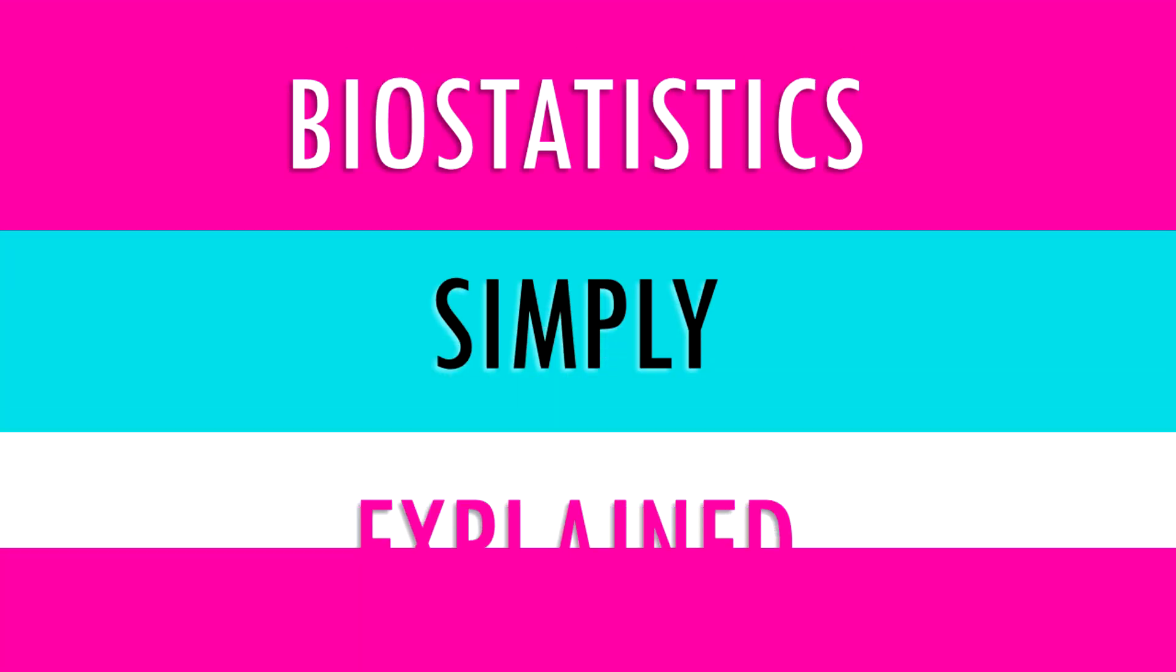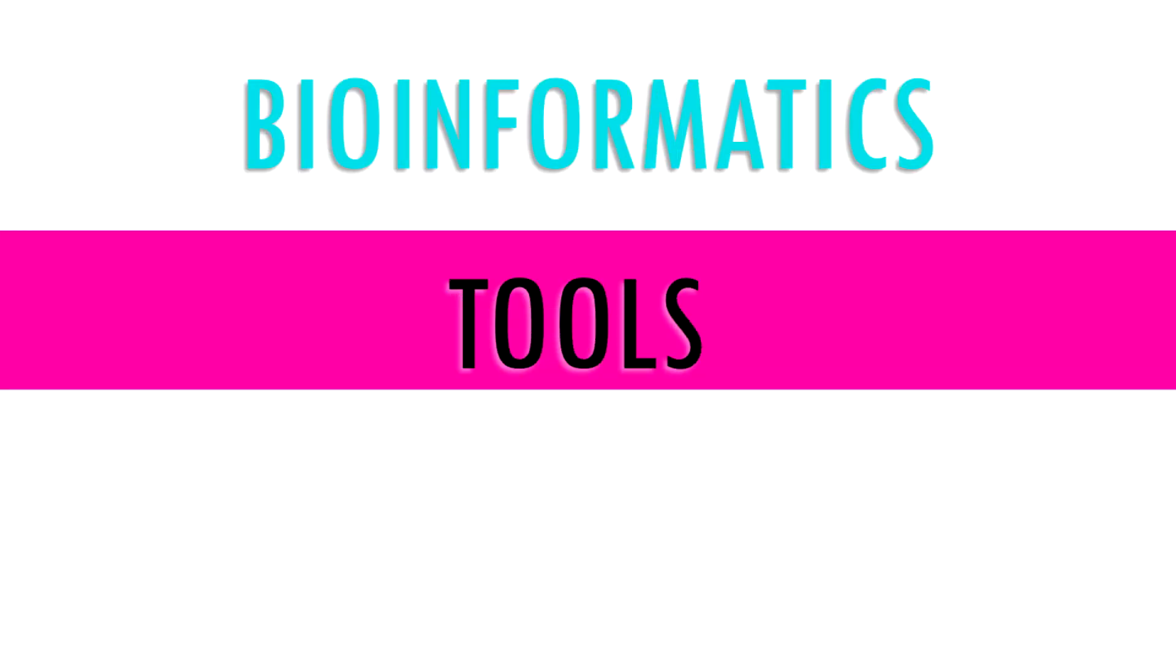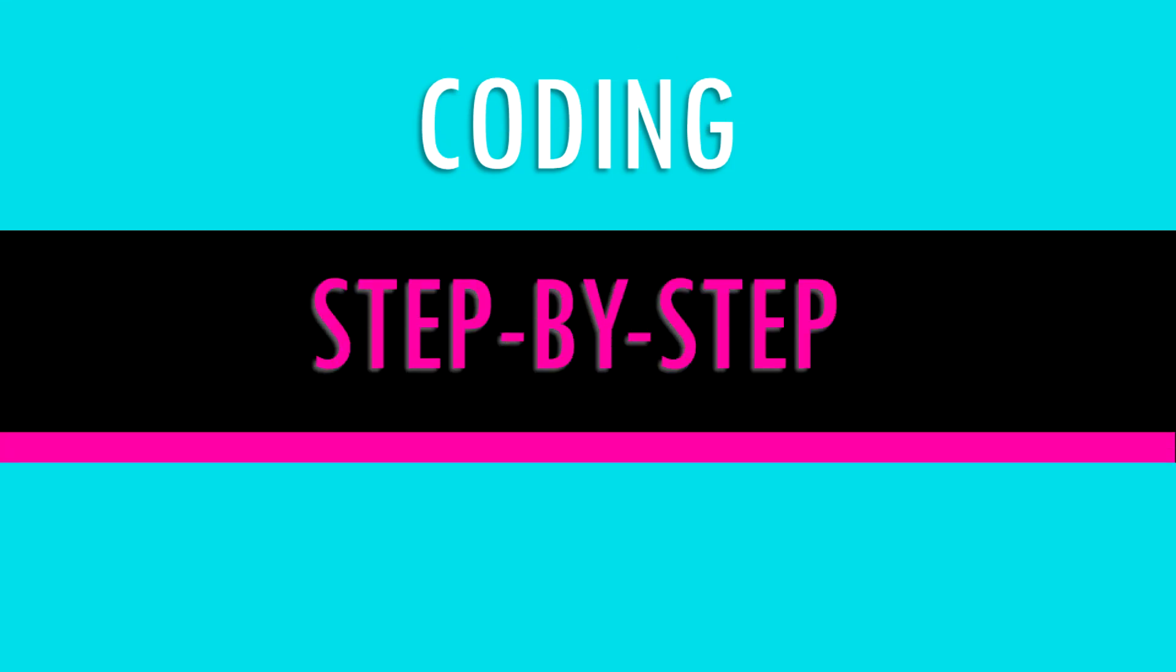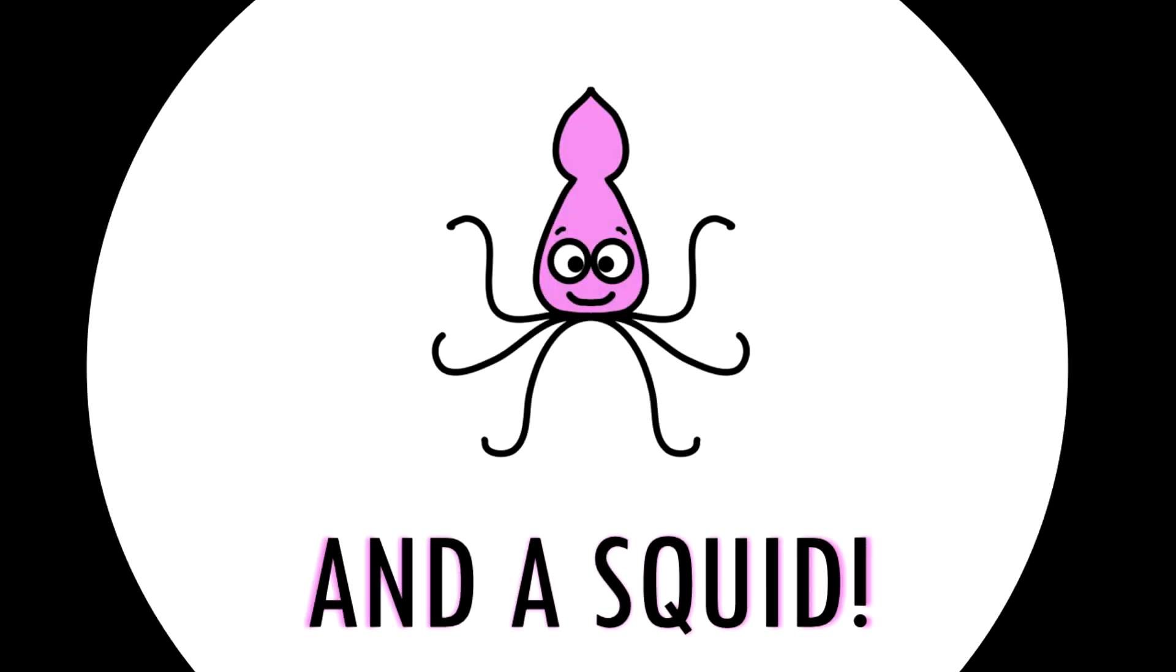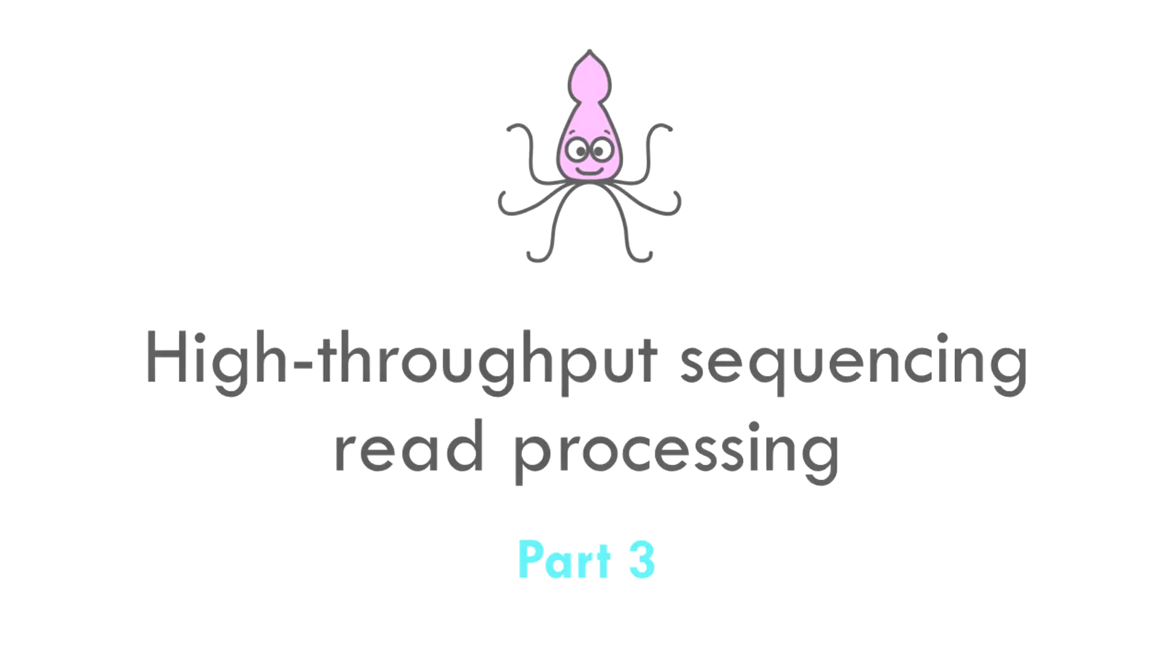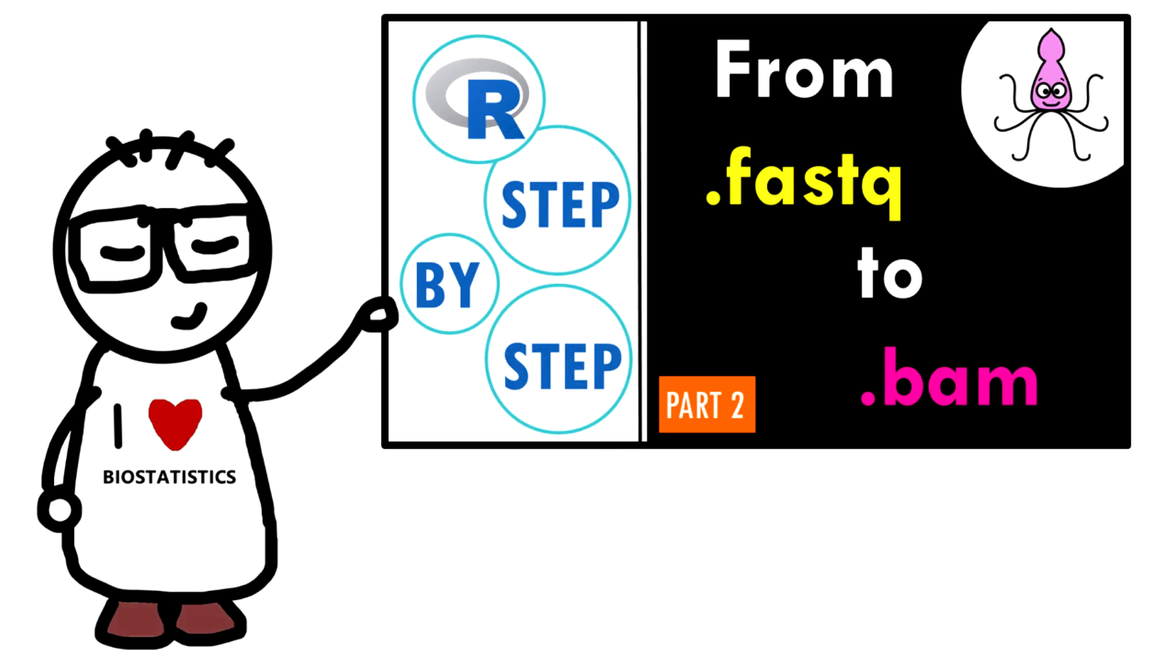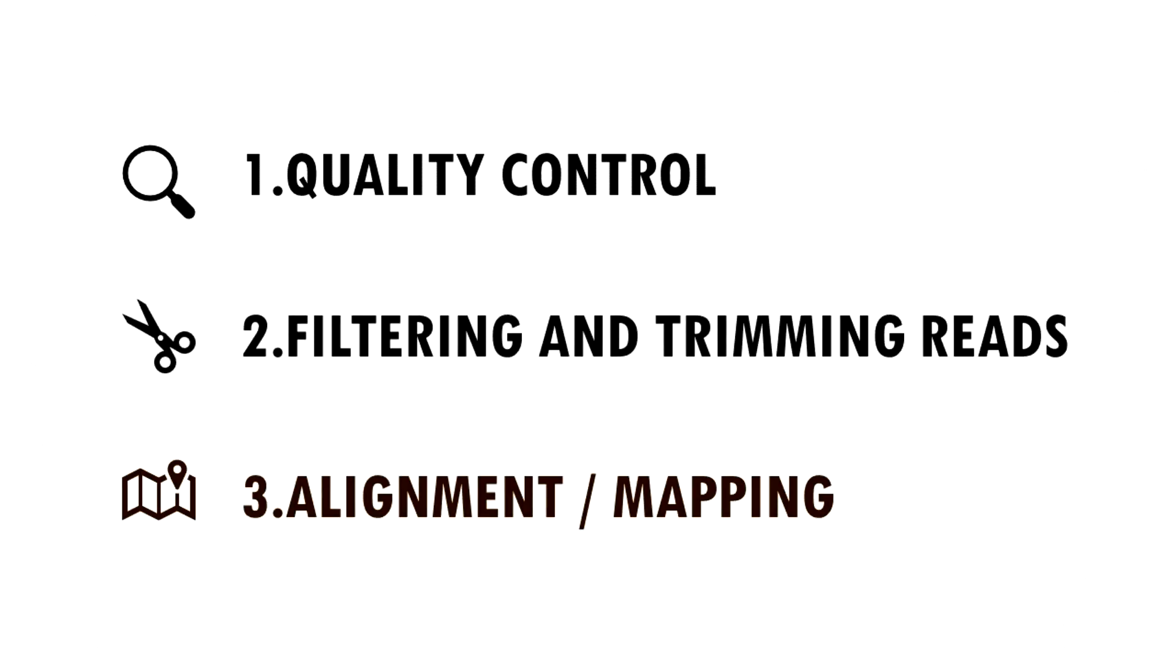Hi and welcome to Biostat Squid! This is part three of our tutorial series where we're going over the basic steps of pre-processing and quality checks of high-throughput sequencing reads in R. If you haven't watched my previous videos on quality control and filtering, do that first since in this video we will finish off our workflow by aligning or mapping the reads onto our genome. Let's dive in!